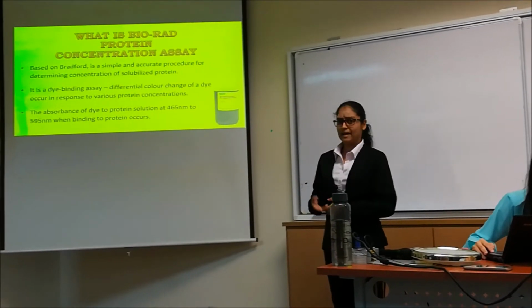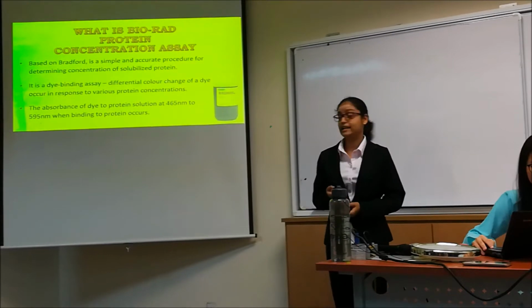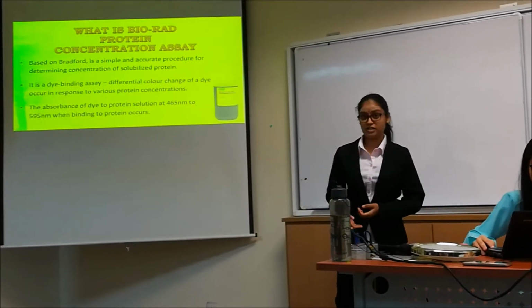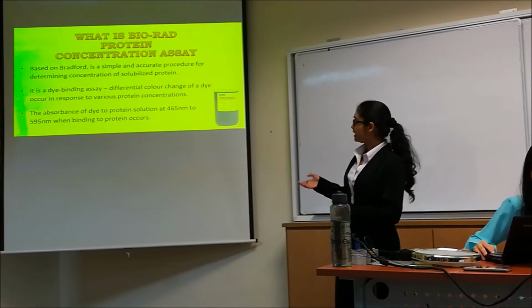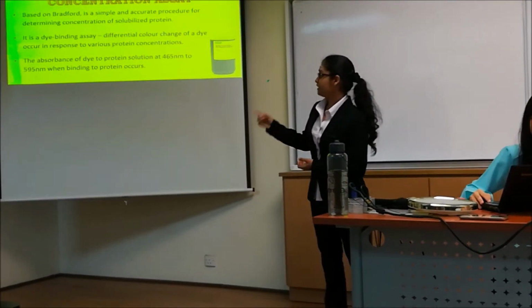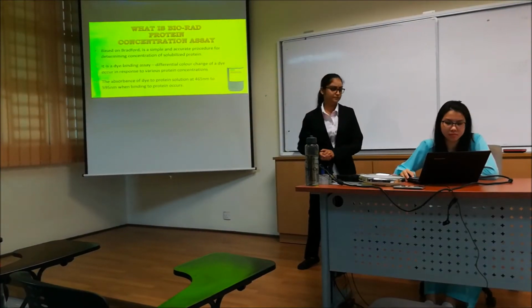It is a dye binding assay, in which a differential color change of a dye occurs in response to various protein concentrations. The response of the dye to the protein solution is measured at 465 nanometers to 595 nanometers, when the dye binds to protein.